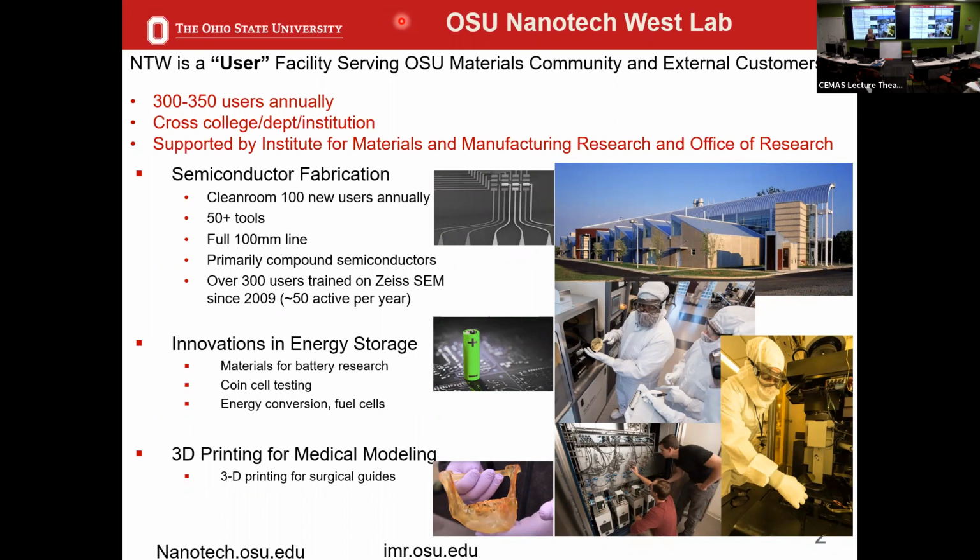So what we are is a research facility. We serve about 100 to 125 new users every year. Like I mentioned before, we have 50 plus tools. We operate on 4-inch or 100 millimeter and smaller, mostly smaller. Ohio State is a very materials-driven community, as most of you are aware. So we're looking at devices on advanced materials. And a lot of times that's not wafer size, that's centimeter size and smaller.